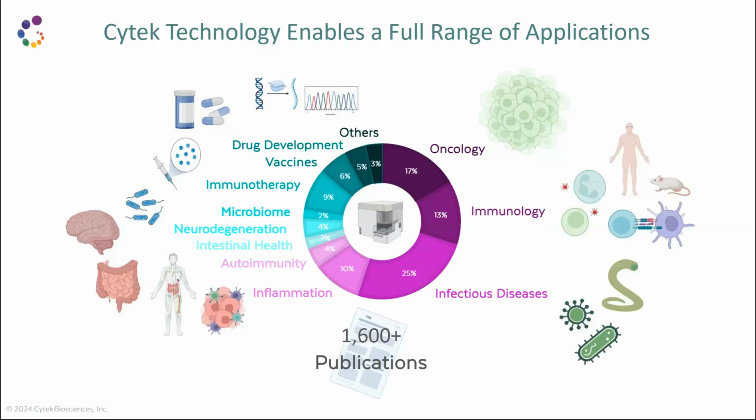But in general, if we talk about the data that has been published, the data that our customers generate, our internal data, our main purpose is to generate high quality data. And high quality data starts with you, with the samples that you bring, how well they were collected, prepared, stained, and also your reagents that need to be high quality, and their stability.